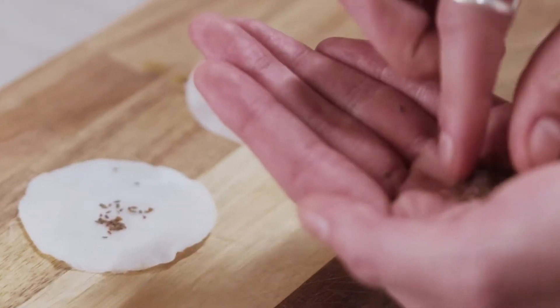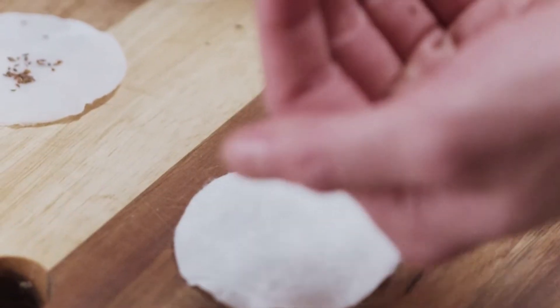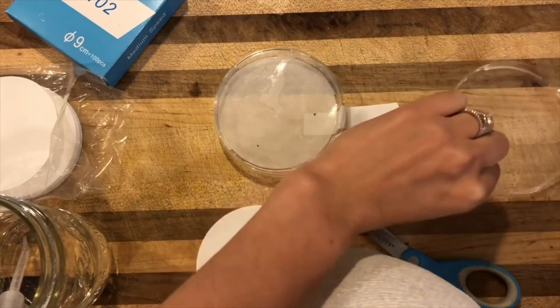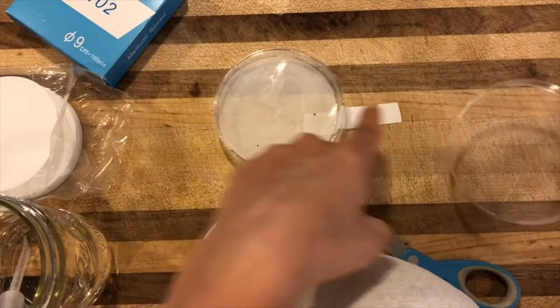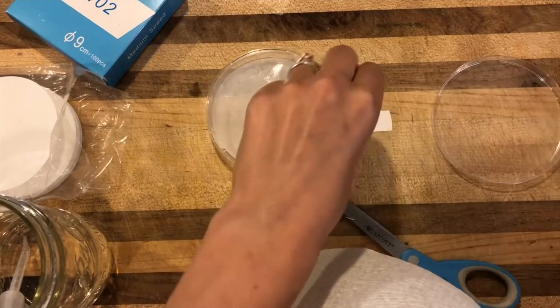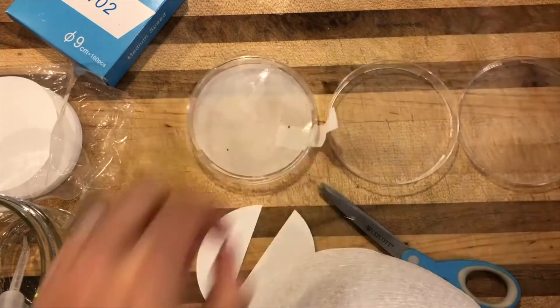Next up, a super simple lab if you're just practicing the scientific method is a radish seed germination lab. Radish seeds are super easy to germinate and all you need is a container, a wet piece of paper towel, and different conditions to put the radish seeds in. Radish seeds germinate very quickly, so you can collect data within several days on an experiment like this.